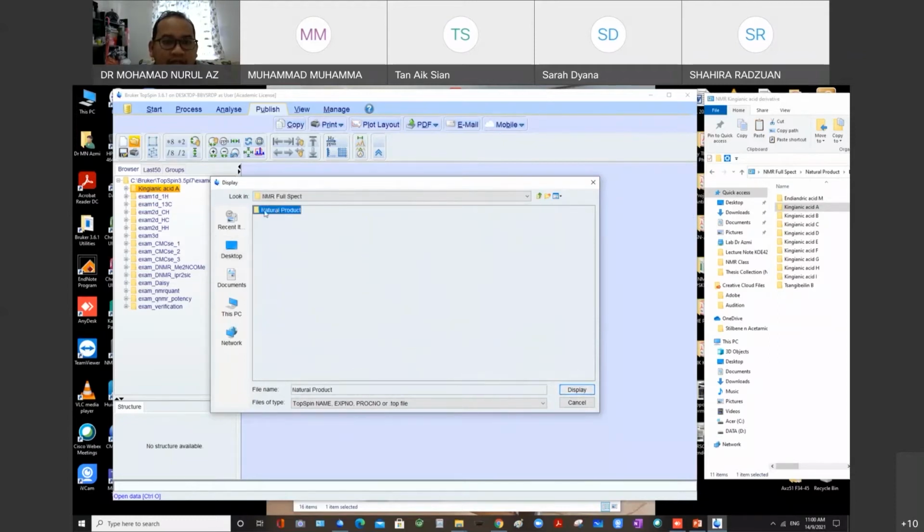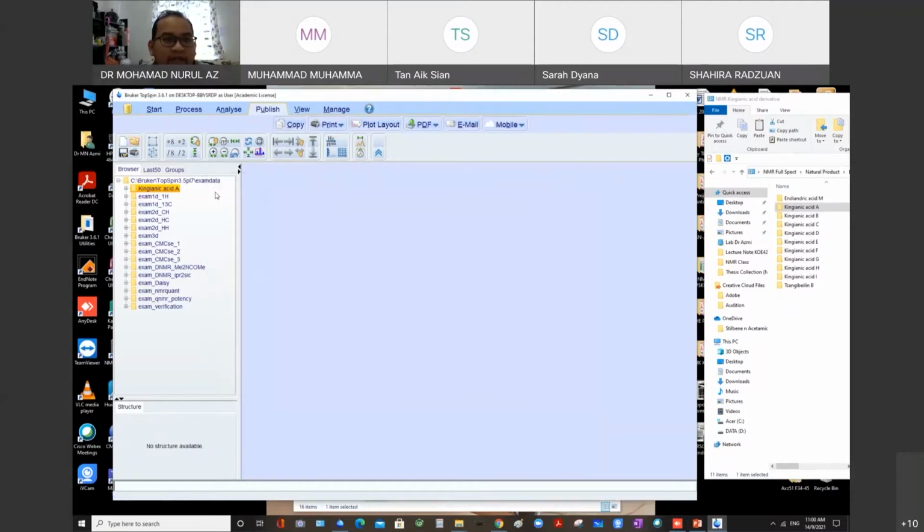This one. Okay, you have to do it manually. And 1, 2, 3, 4, 5. If you don't remember what experiment one is, you can change it easily. Don't worry. Okay. So this one is for print, and this one is a new data set, something like that. Okay. So the rest that I want to show, we show you after this.